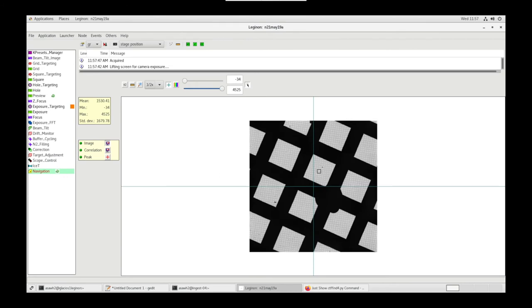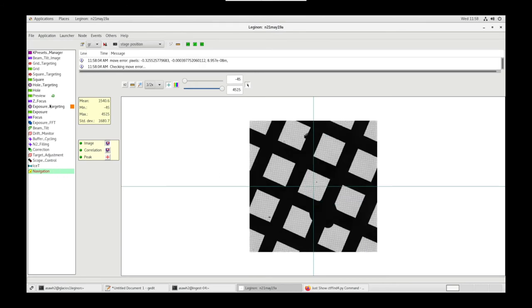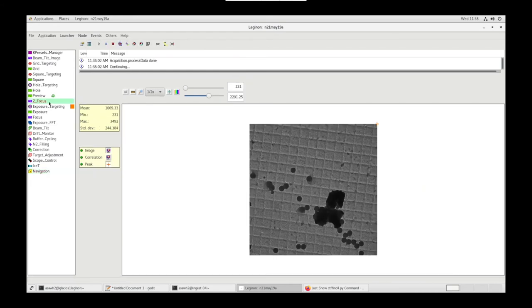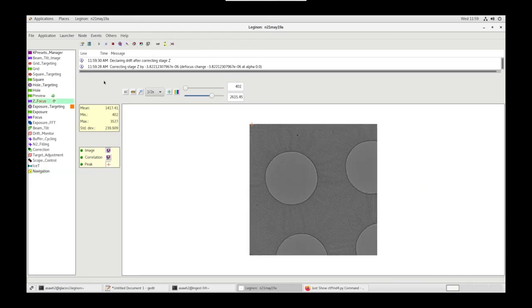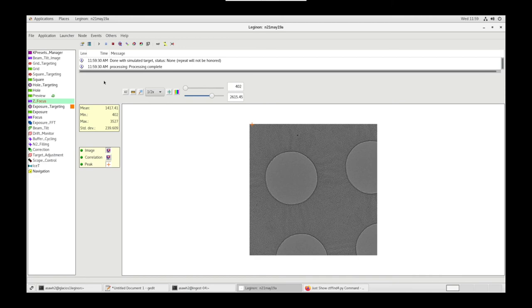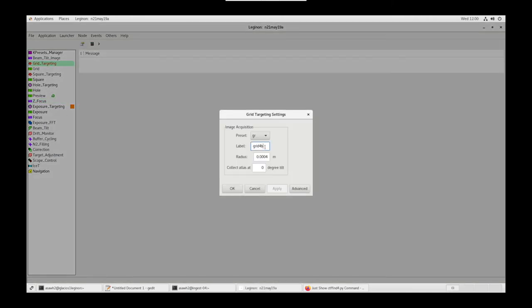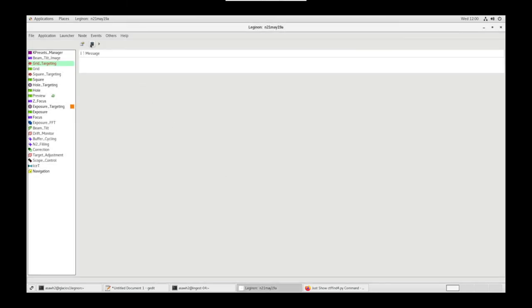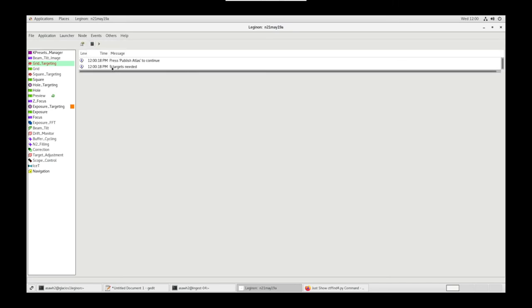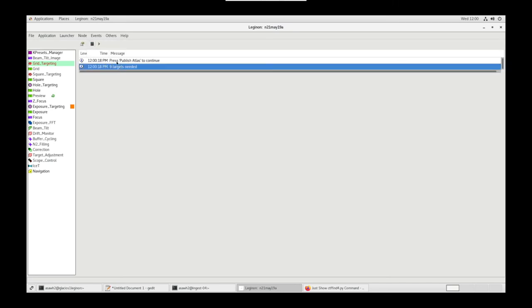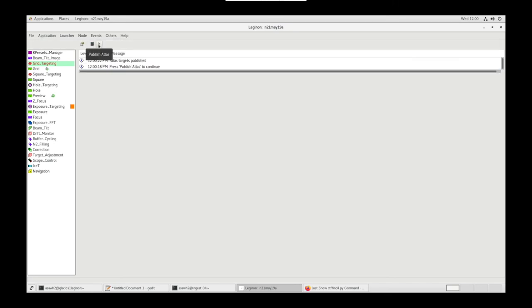Let's use our Cursor tool to center over a square. Let's go to Z Focus node, simulate a target. Once complete, go to Grid Targeting, Settings. Let's change the name for our label. We can make this Grid 1 or whatever you'd like. We can change the radius to whatever we'd like. The maximum that we can do is 0.009. Smaller atlases will take shorter time. OK. Calculate the atlas and publish the atlas.